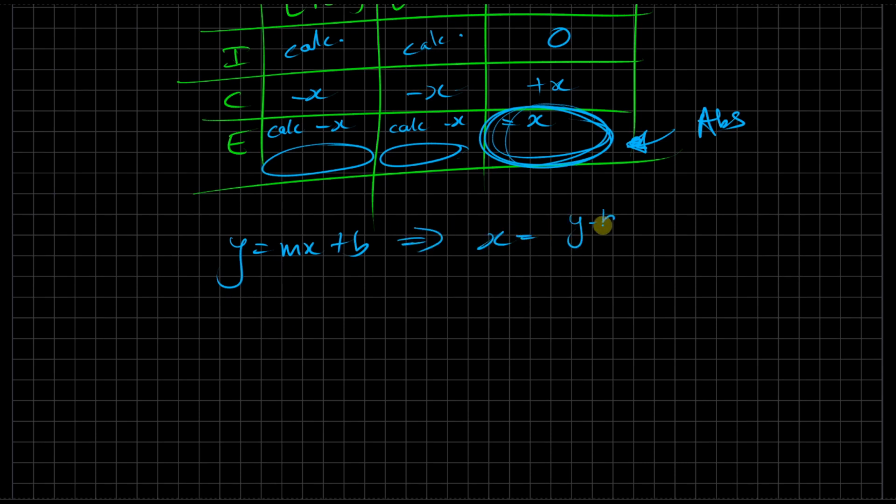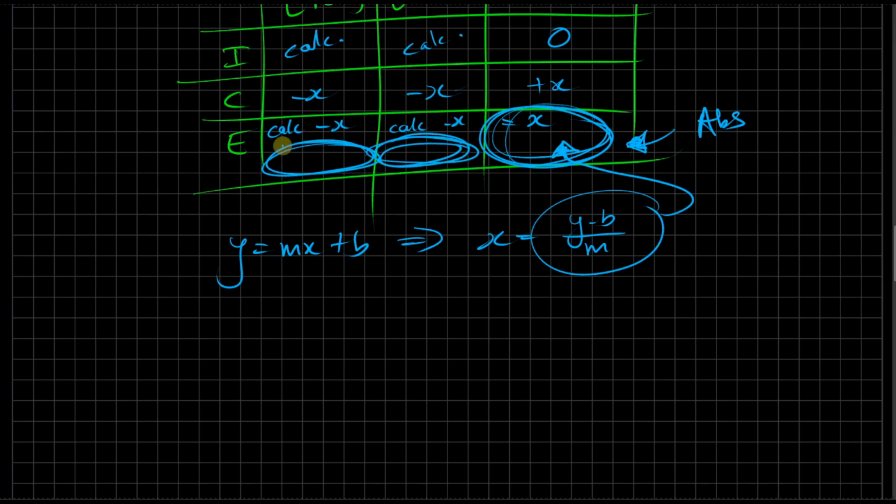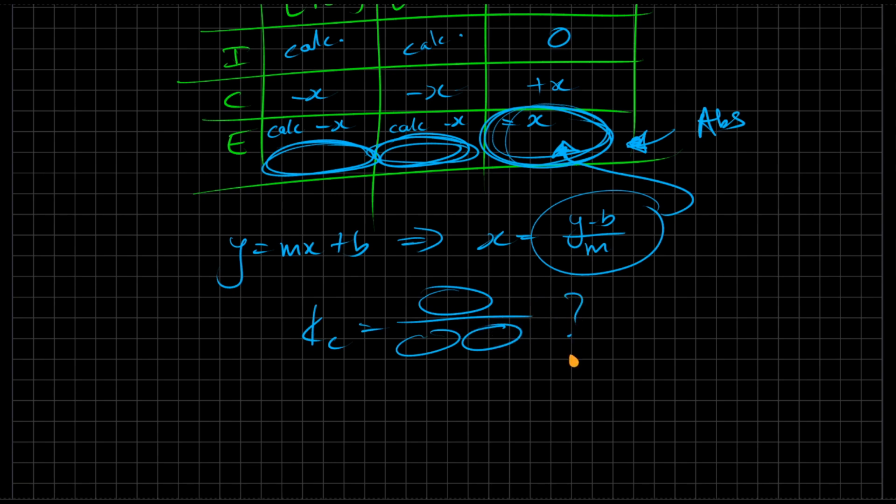So we'll have y minus b over m, which will give us the concentration x, the same x that actually fits there. We'll know x, which means we can also calculate what goes here and here for equilibrium concentration, and then we can calculate Kc by using those 3 values here. And that's it. That's the gist of the lab, right?